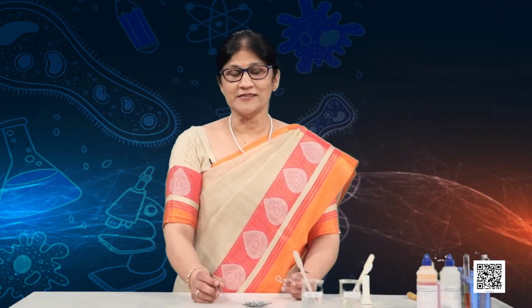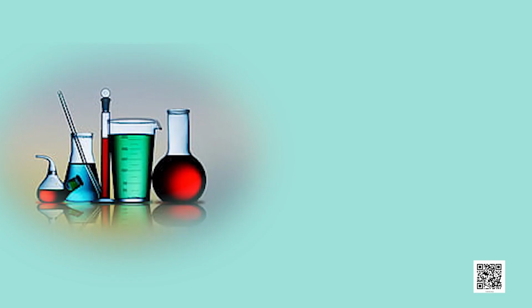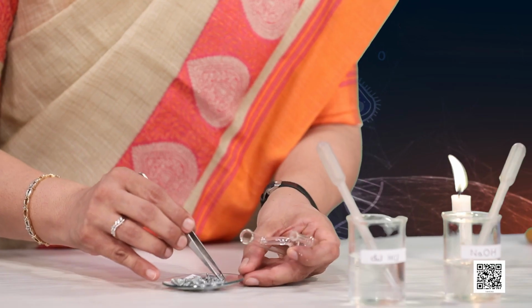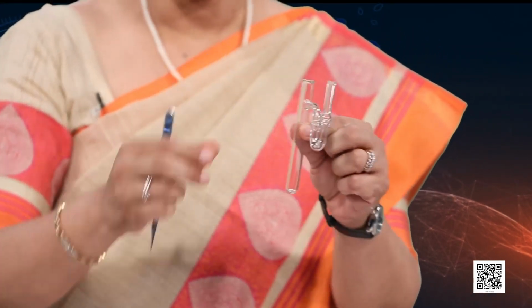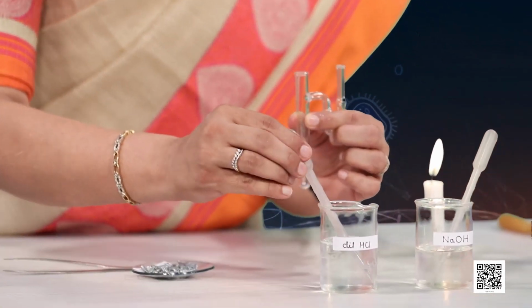So my young scientists, after understanding how acids and base react with each other to give salt and water, let's see how an acid or a base reacts with a metal. So I have some zinc metal with myself. Let me pick one zinc metal piece, and this is a U tube, a special tube, and I am putting one piece of zinc metal in this, and now I will add some dilute HCl to this.